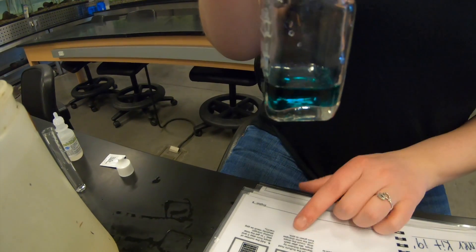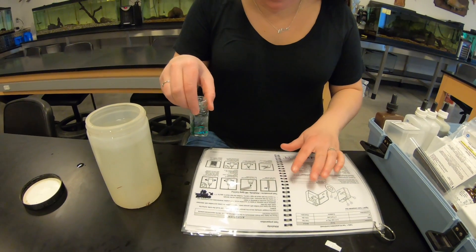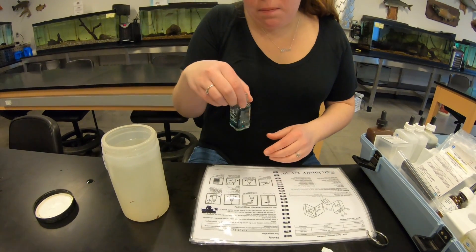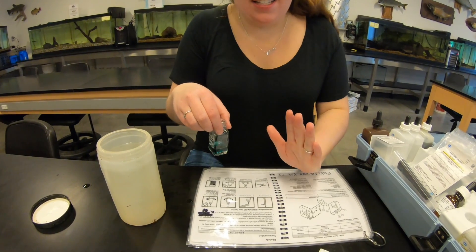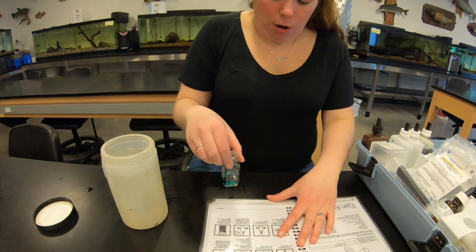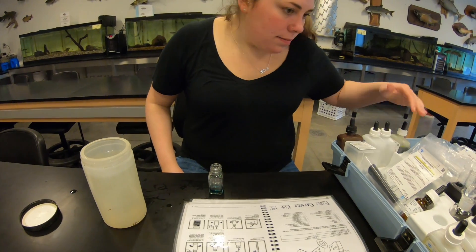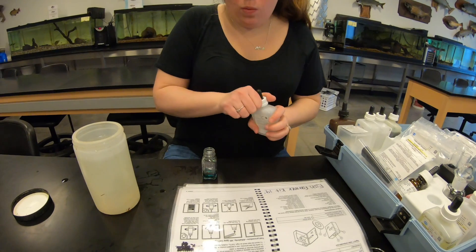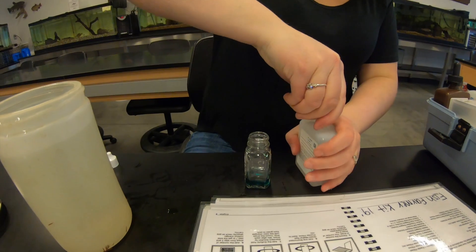For step seven, we add sulfuric acid standard solution by drops, mixing after each drop, and count the drops until the color changes from green to pink. As soon as you have a color change that stays - even if it's not perfectly pink - that's what you're looking for. I'm going to grab the sulfuric acid. With those drops, you want to hold the dropper straight up and down.